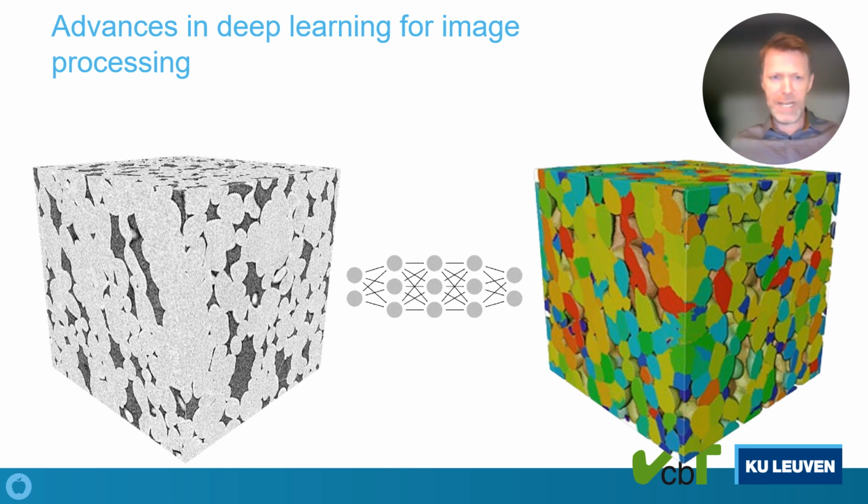Now with conventional image processing, this is very hard to do because it's very difficult to find where the interface of the different cells are positioned in these clusters. Now, making use of a considerable amount of labeled data that we have been collecting in the past, we were able to train a deep learning network that was also tested on new samples that now automatically is generating the labeled images of the individual cells of this tissue.